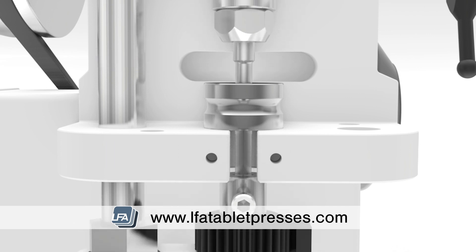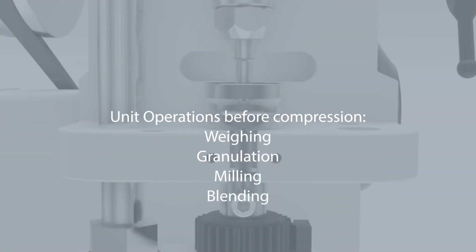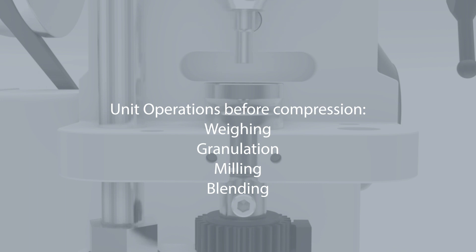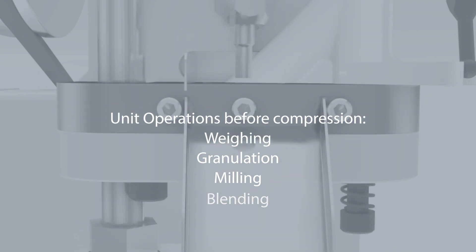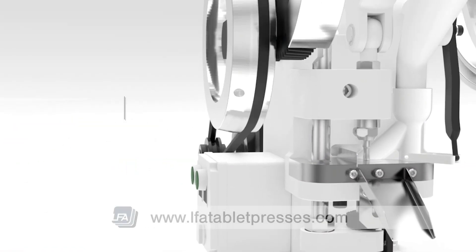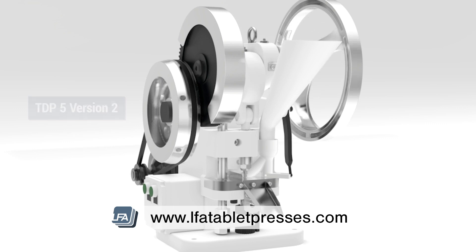Before compression, your tablet mix can go through multiple stages of unit operations — from weighing, granulation, milling, and blending — which all affect the final product. We're using LFA's TDP5 Version 2 desktop tablet press for this example.